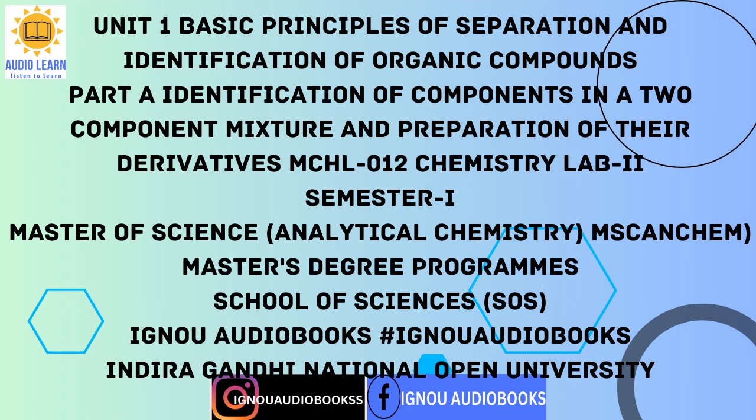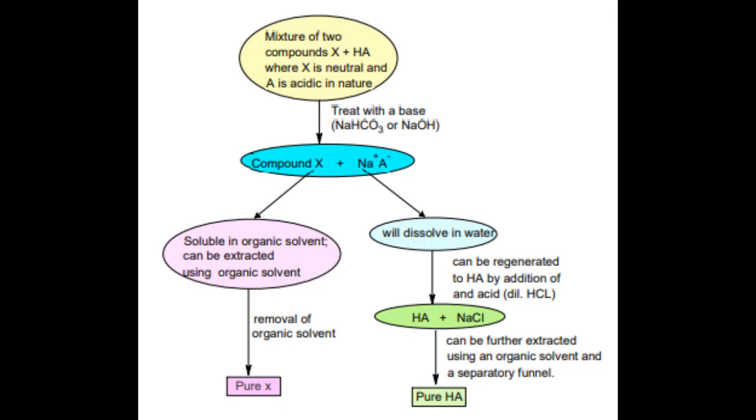Also, when we have to separate two organic compounds, we take advantage of their acidic basic properties, i.e. their chemical nature, and convert these acidic or basic compounds to their salts which are water-soluble. Hence, an acidic or basic compound can be separated from a neutral compound when present in a mixture by using solvent extraction or liquid-liquid extraction. 1.3 General methodology.